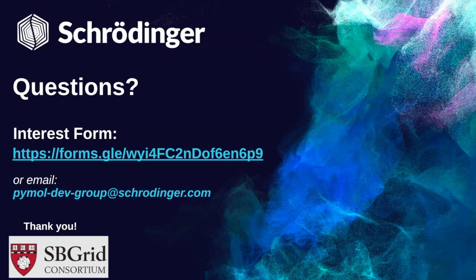So we may spend some time improving that library, looking for additional ones too, to augment that. But I just wanted to highlight the ability now that you can take rotamers and attempt to fit those into densities. Yeah, no, it's very cool. It immediately brought up the question in my head, like, oh, you can use geometry now in density. Where is the geometry coming from? Because I've used PyMOL for a while and didn't remember there being any geometry in it before. Very cool stuff.